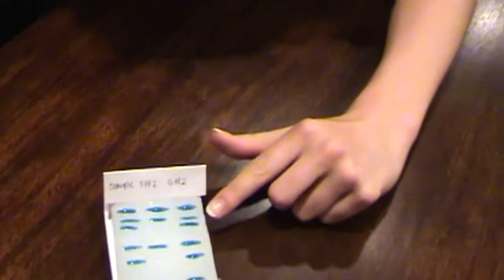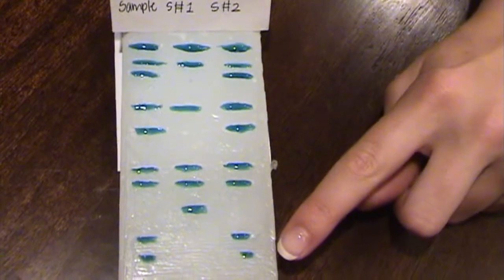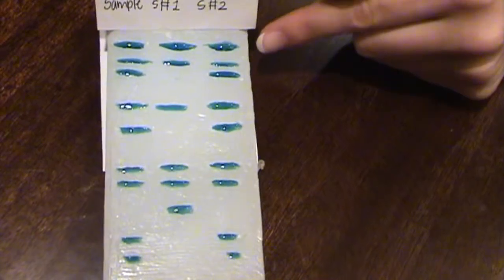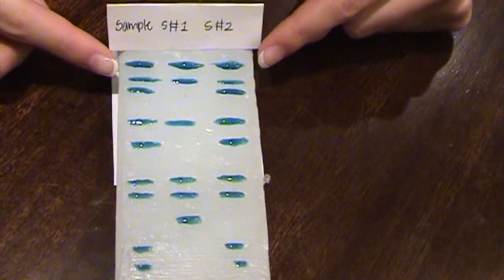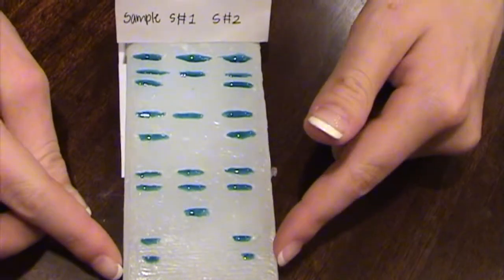After a few hours, the DNA has moved through the gel. As you can see, the larger particles settled at the top while the smaller particles settled at the bottom. This is because of the smaller particles' ability to weave through the gel much faster than the larger particles. The sample was a perfect match with suspect 2 because its DNA lined up exactly, as you can see on the agar gel.